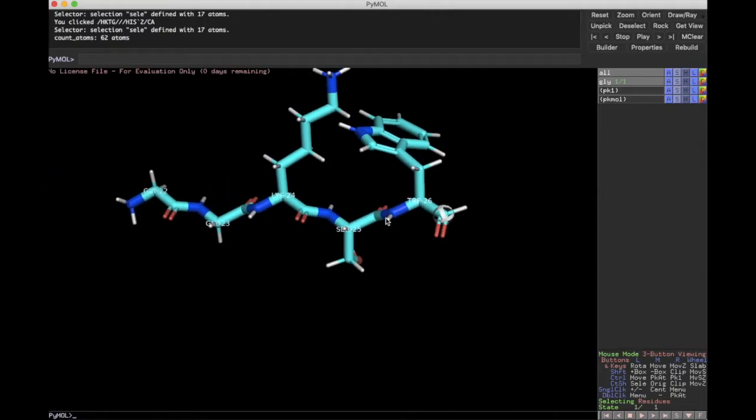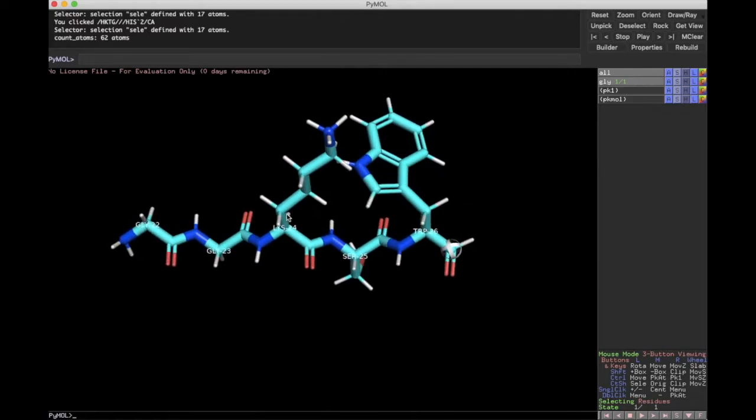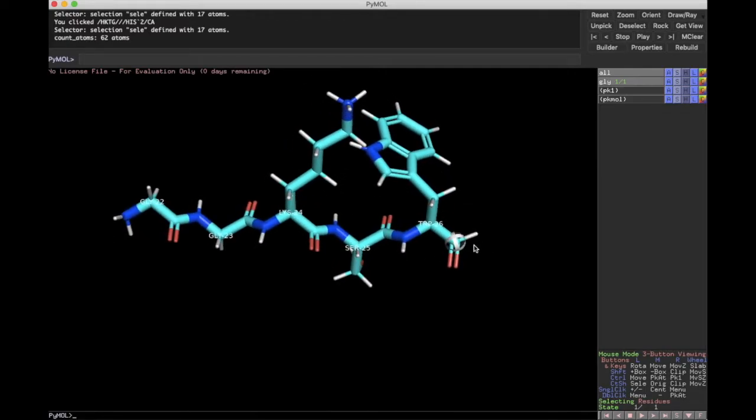But when we add this into, or combine it or link it later on, this is going to disappear, and a bond is going to be formed here with the amine of the next part of the chain. And similarly, one of these hydrogens is going to be gone, because that electron will need to bond to the C terminus of part of that other protein.